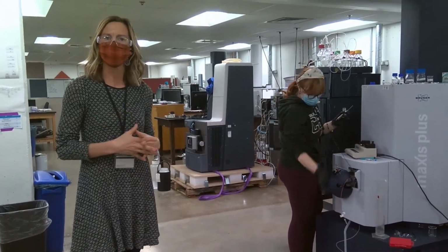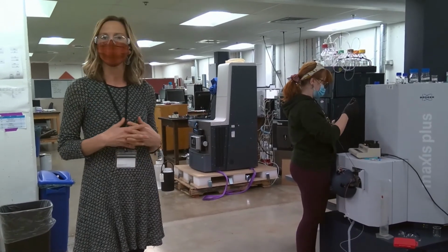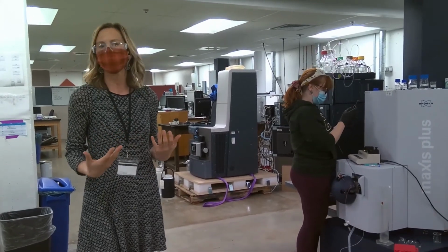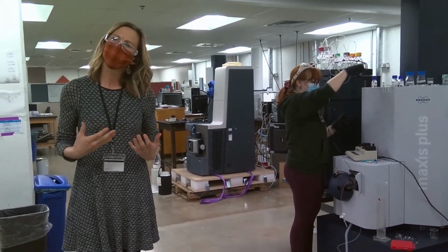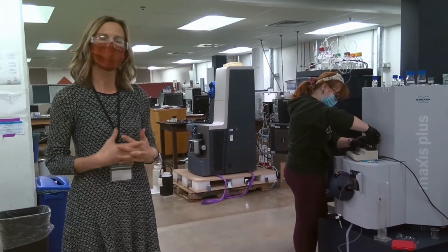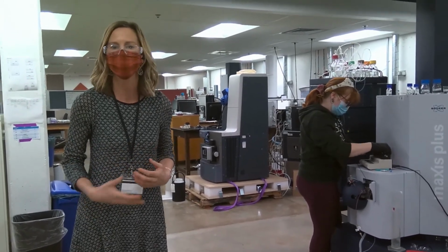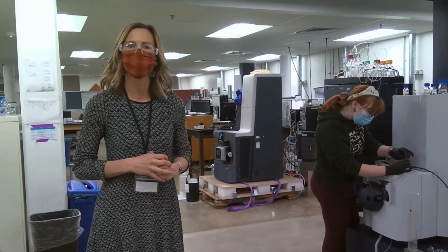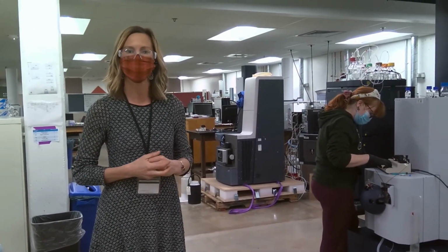And then you sign up for time on our instruments through our online iLab booking system. And after that, you perform a quick proficiency test. You can run instruments independently, or for some more advanced work, you can ask for the ARC staff assistance. We also offer workshops and hands-on training courses, advanced application trainings, often together with our instrument vendors. This is really our way to introduce technology to new users, new faculty, new students. We also have classes from CSU that come through the facility, and we assist them and facilitate hands-on learning modules. And some of our staff even teaches in these classes as well.